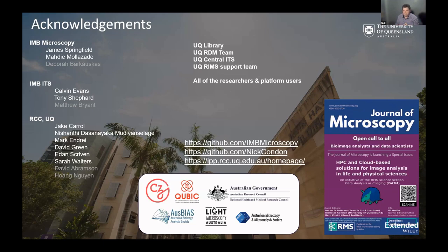We've written all the software that communicates with the booking system, and if you don't have a booking, it'll boot you off. It's smart enough to know that your lab mate has booked it and you're in the same group, so that's okay. There's been lots of scope creep and versioning of that.